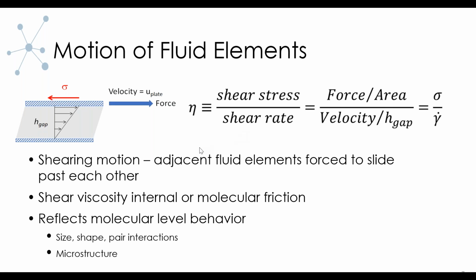Viscosity isn't just a number. I want to point out that it's also a reflection of the molecular interactions, and it reflects molecular level behavior, basically. With this, you can get an idea of the size of the molecules, the shape, how they interact, as well as the microstructure.